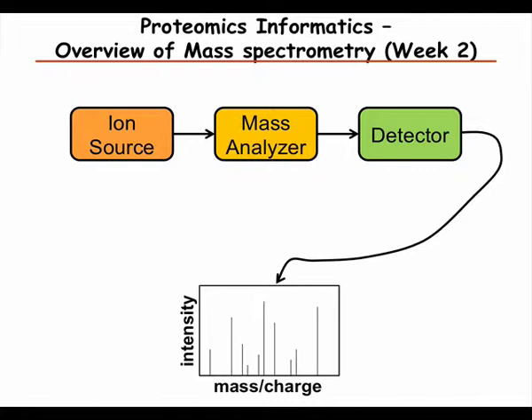But if you compare two different molecules, and one of them has a peak that's 10 times as intense as another one, you can't in general say that there is more of that material, because different molecules will have very different ionization, so you will get large differences in intensity, even if you have the same amount, if you have different chemical structures.